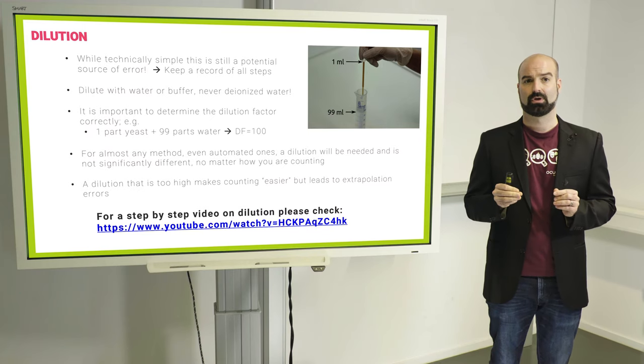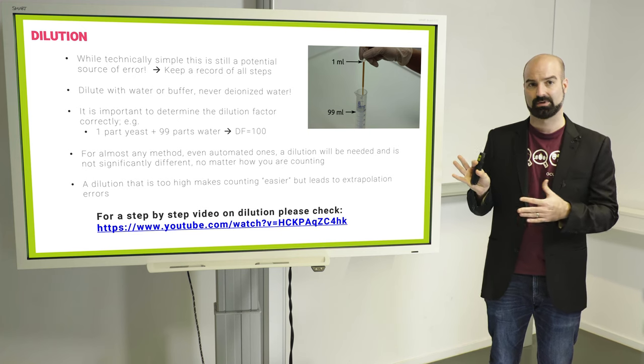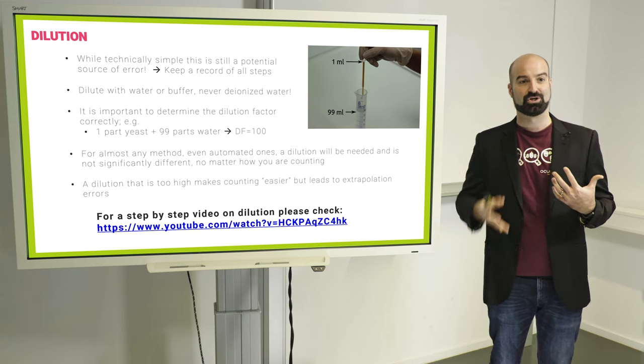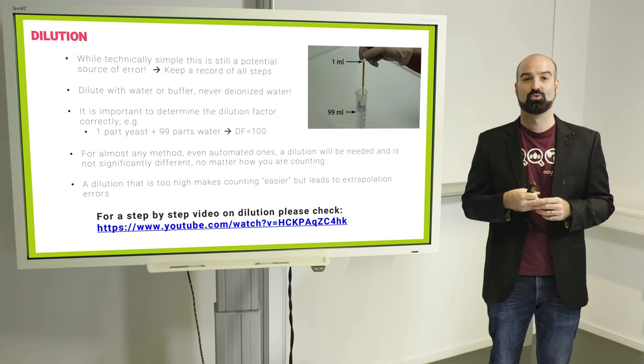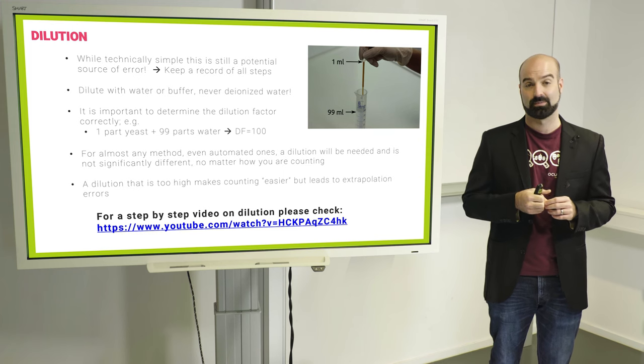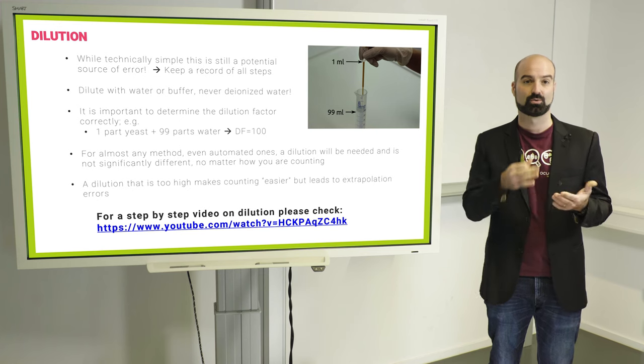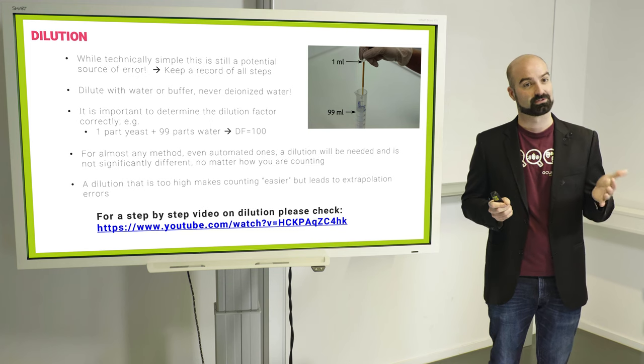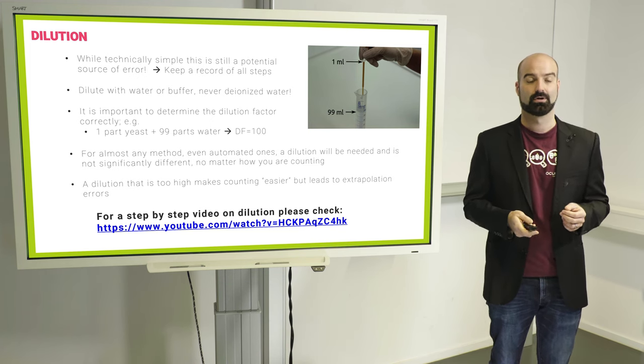It's important to note that almost any system used for counting, I mean we're talking about manual counting here now, but automated counting as well, you will have to dilute yourself. So any mistake you make here, automation is not really going to save you. And finally, do not dilute too much just to have an easier count. This is something we've seen quite a bit as well, where people dilute maybe by a factor 10 more than they should, just so it's quick to count because you only have five cells in your counting grid. So definitely don't do that. Just dilute so you have a reasonable number of cells in your counting chamber.